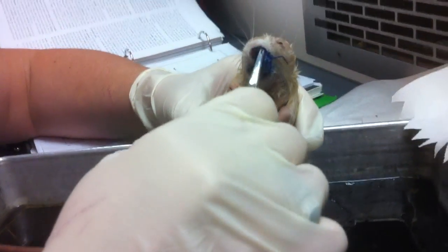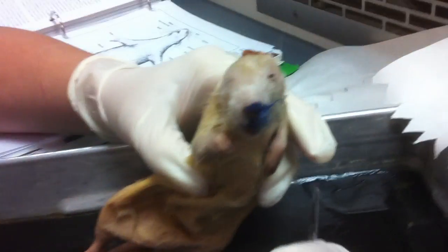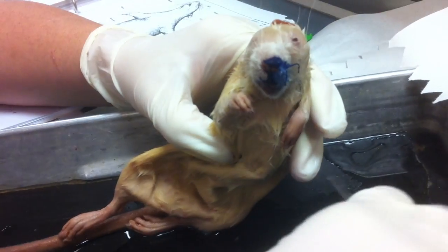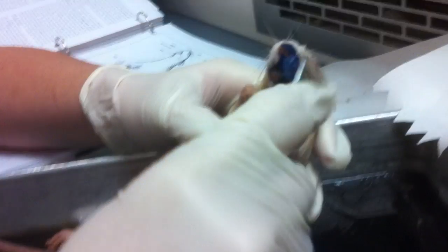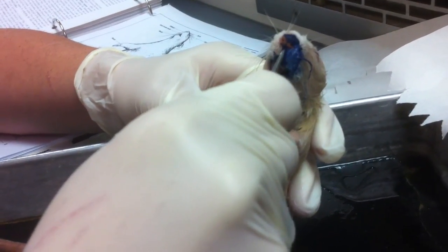Here's her nose. The openings are called the nares. The whiskers right here are called the vibrissae.